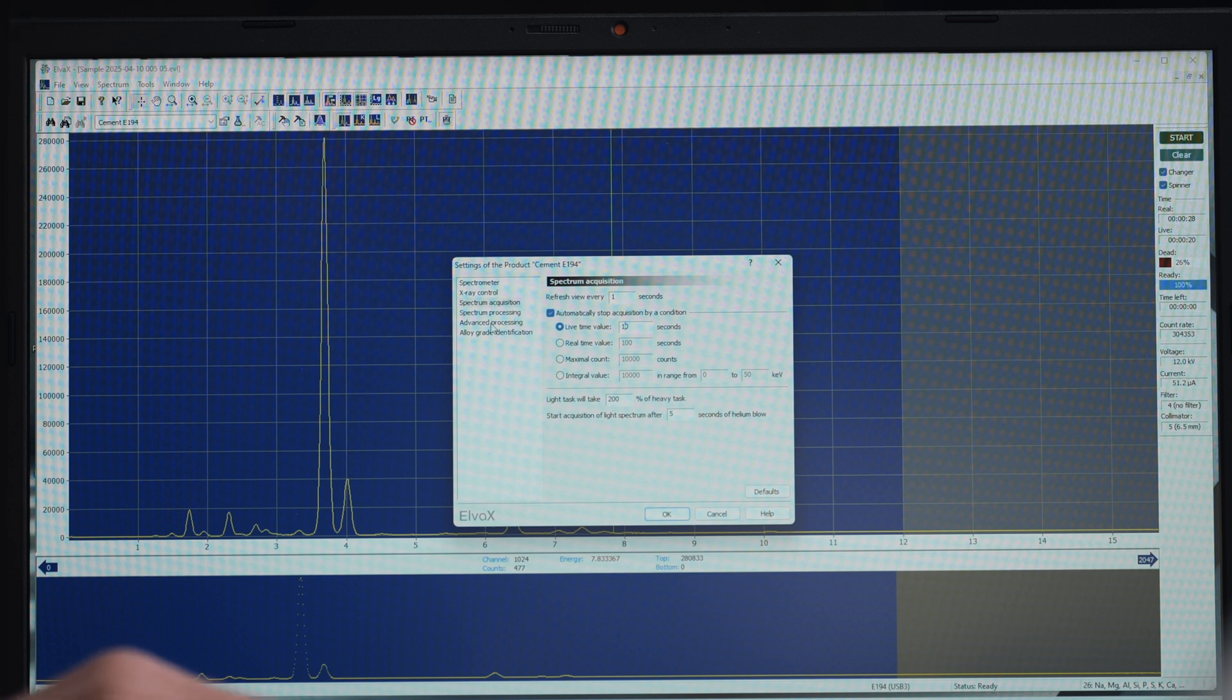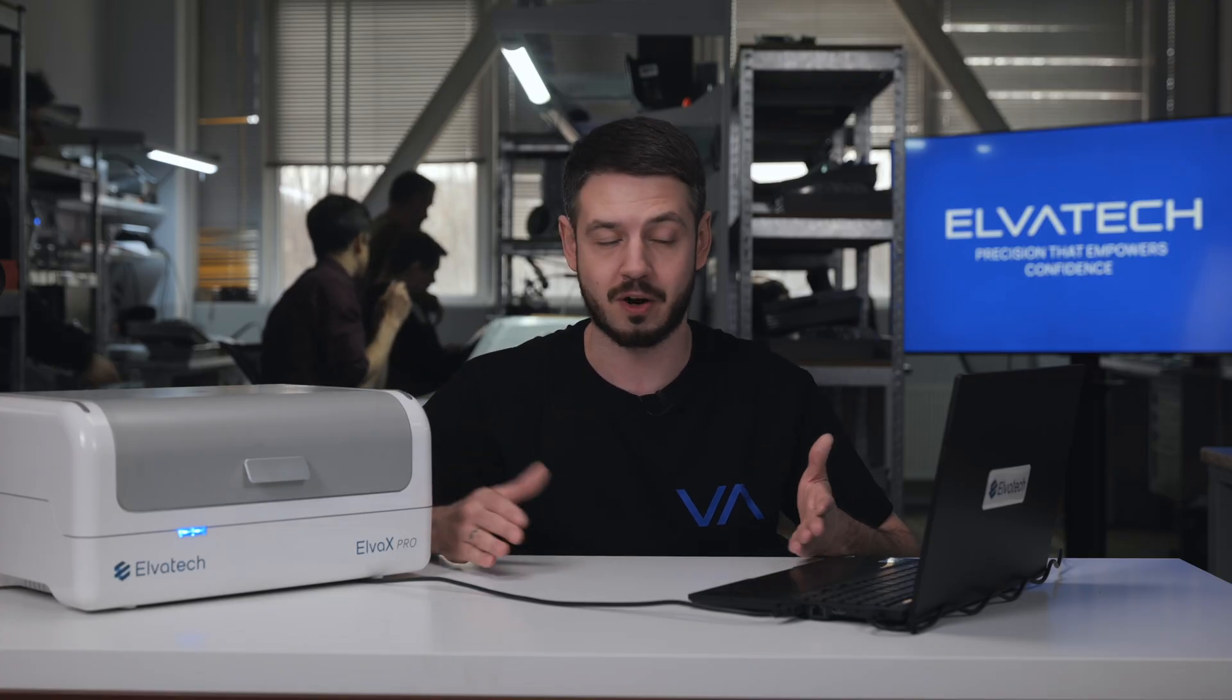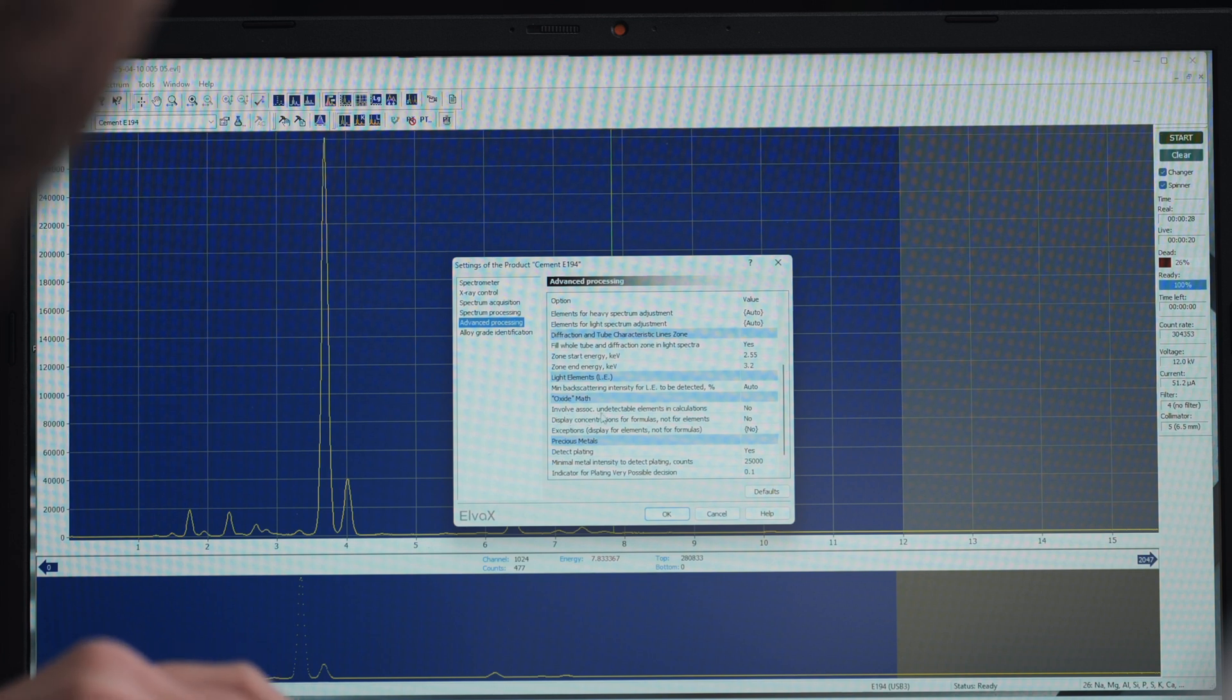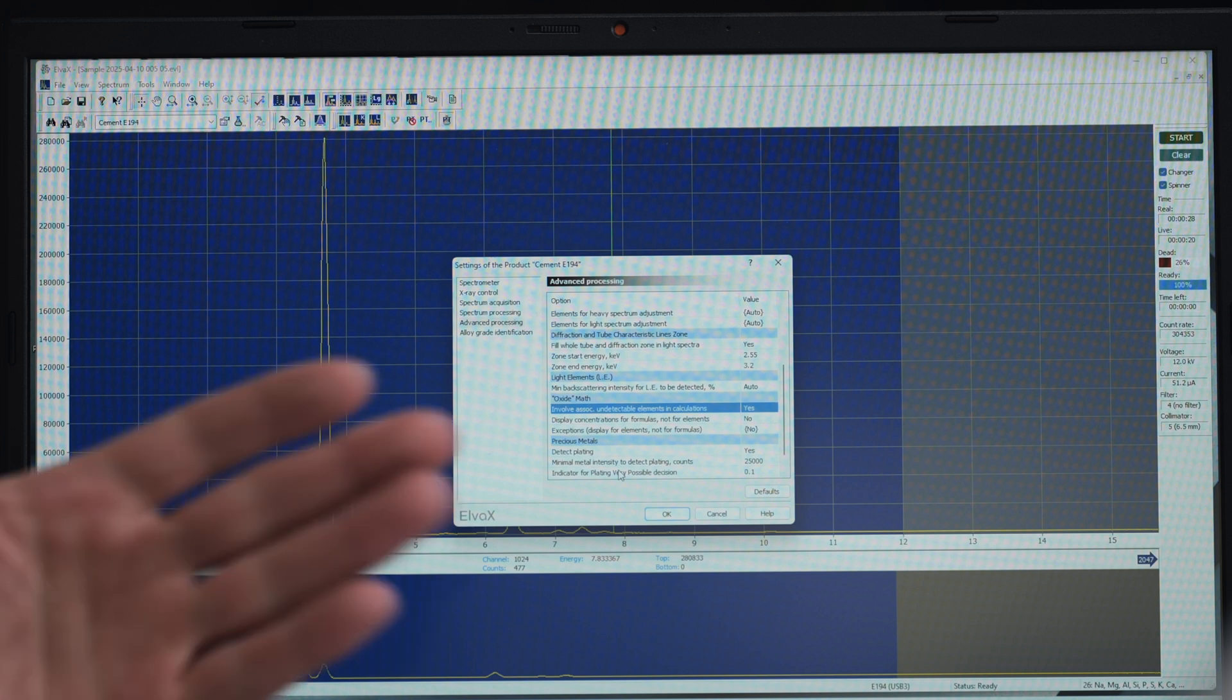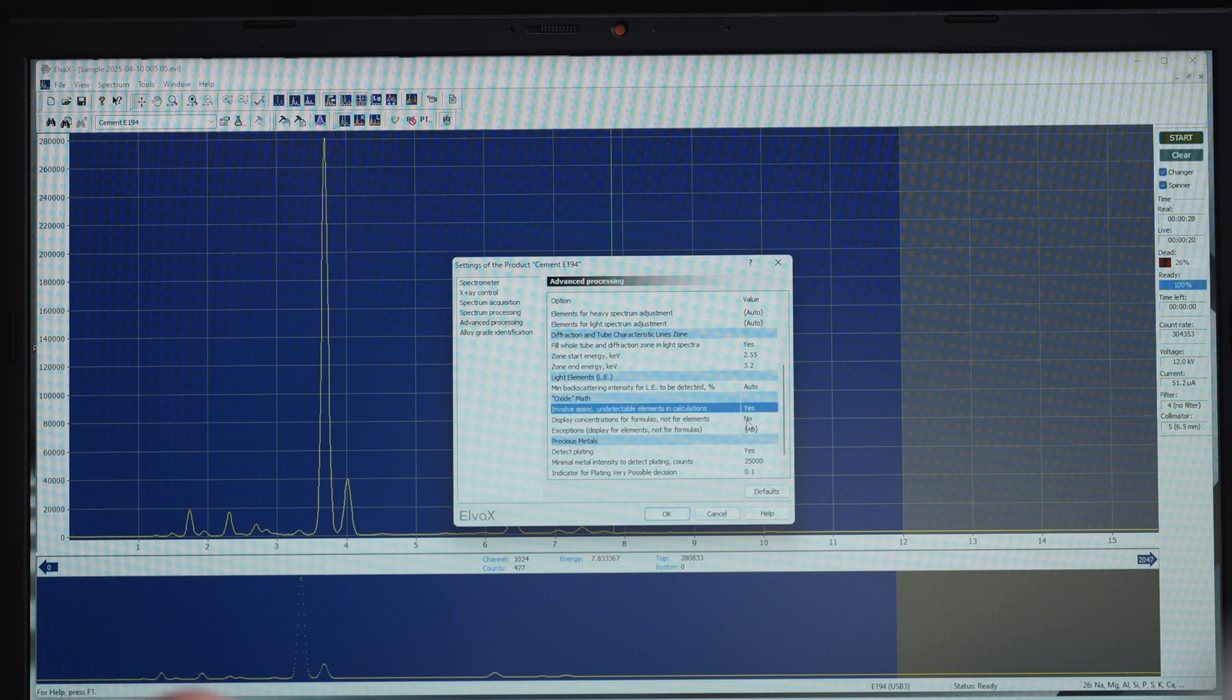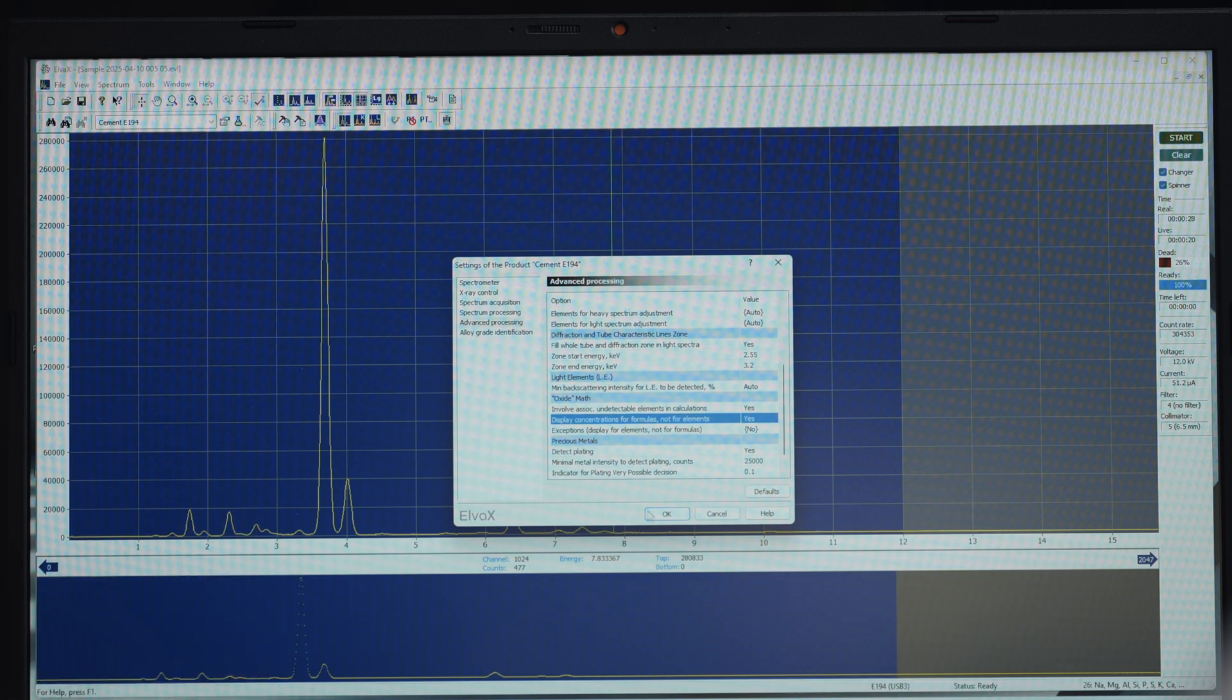Next, we go to advanced processing. As we measure cement and we need to get the results in oxide form, we're going to mark the sections. Here, you can find oxide math. Then, we need to involve accessories, undetectable elements in calculations. We mark it, yes. Just click it twice on this field. And then, the display concentrations for formulas, not for elements separately. That's also what we need. We just click twice on this section. After we've done these settings, we just need to save them.